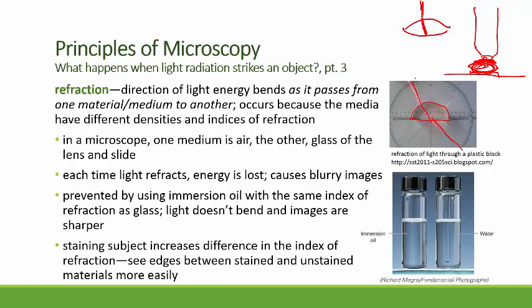Here we can see light passing through first glass, then through water, and then reflecting off of this glass rod that is suspended from the lid inside.